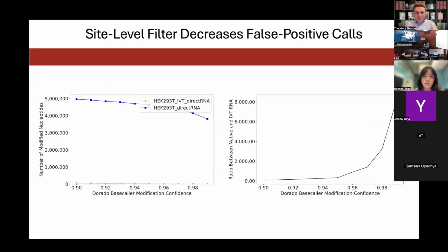And so for a lot of your single molecule projects, this is the filter that I'm going to have you implement and use in order to make your comparisons and to understand this data. And if you ask what's the secret sauce, what is the game changer that causes this dramatic difference in being able to measure m6A stoichiometry, it has to do with looking at the individual distributions of calls within a particular site or k-mer motif.